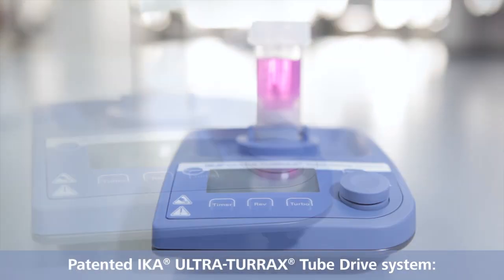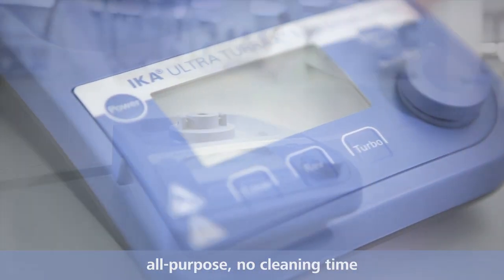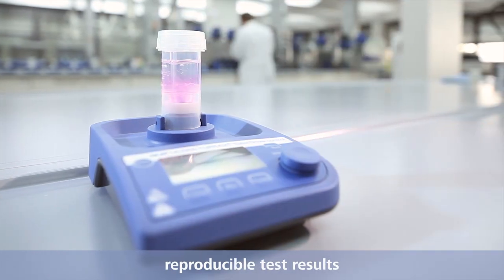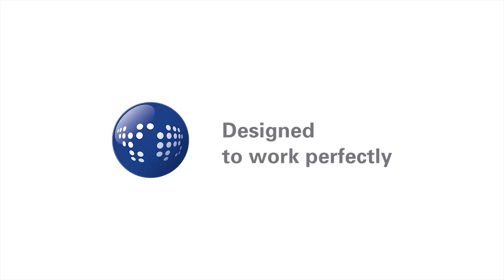The patented IKA Ultra-Turrax tube drive system is an all-purpose and easy to clean system that enables reproducible test results. Designed to work perfectly.